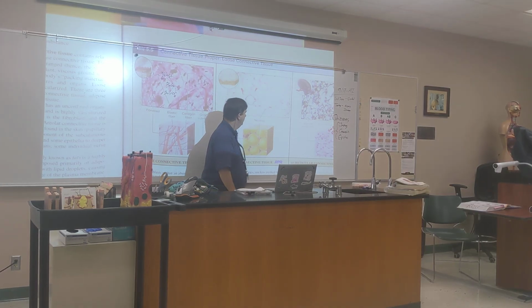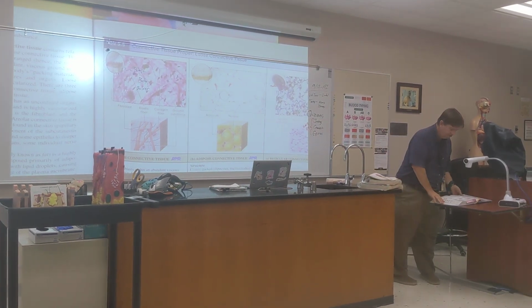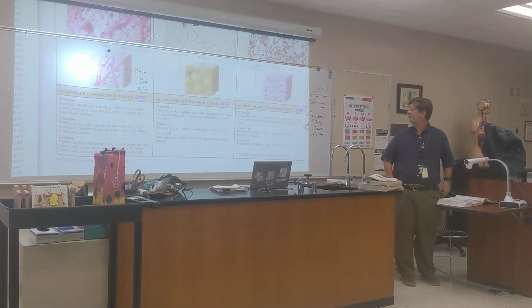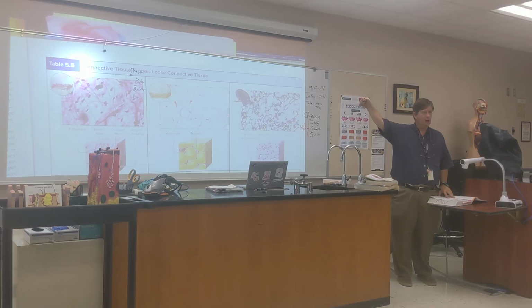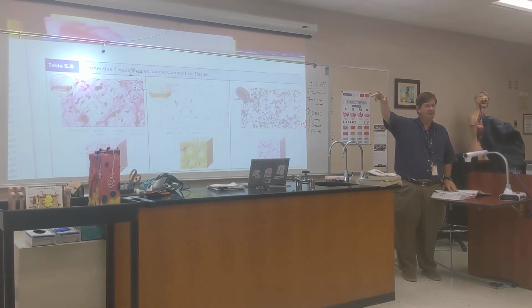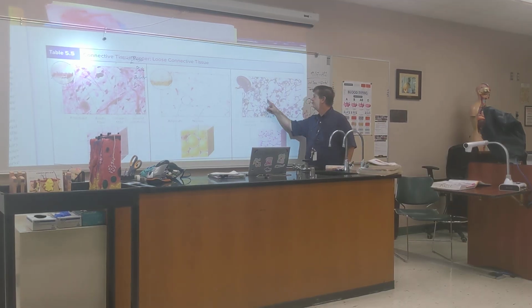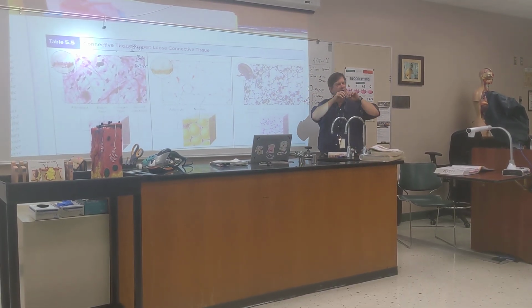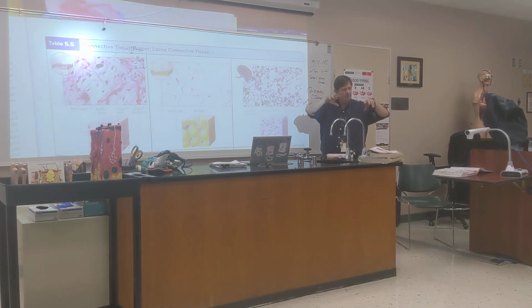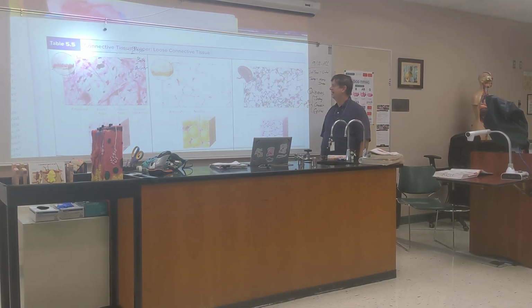Okay. Now this is reticular fiber. I told you that there were three types of fibers. You may remember the three types of fibers. I said three main types of fibers. Collagen, reticular, and elastin, yes? Okay? So this has a lot of reticular fibers. Those are made out of collagen, but they're really fine, diffuse, spread out. They're the scaffolding that these white blood cells are crawling around on, hanging out on.